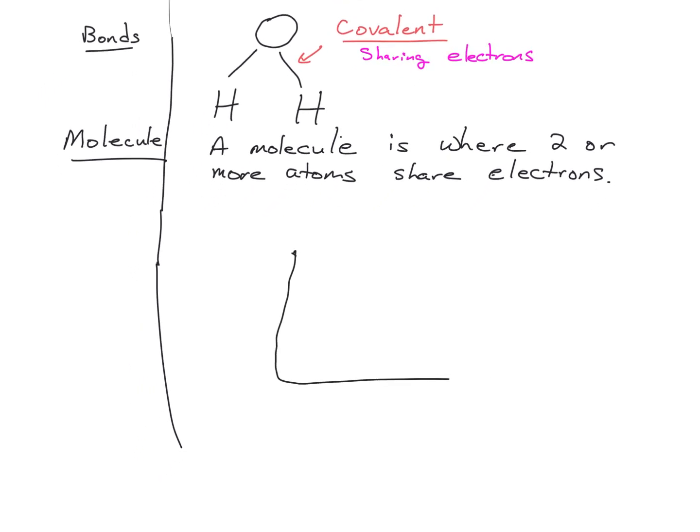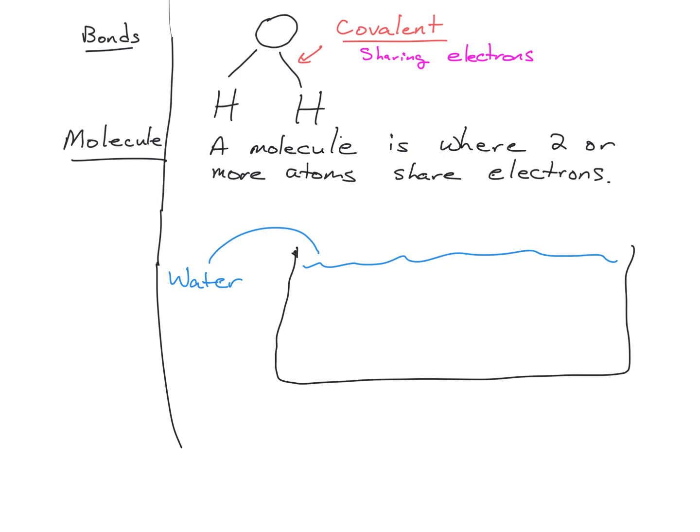You have in front of you a tub. In that tub, there is water. Now, pure water does not conduct electricity.